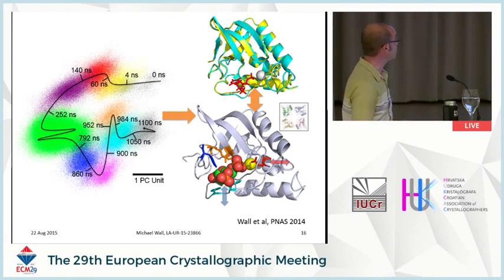And so what we found is we were able to get reproducible calculations of diffuse intensity using such a long trajectory. In this space, we were able to relate this to the functional motions of staphylococcal nuclease. In particular, in this projection, which is along the principal components of the trajectory, we see motions of this loop, which would likely modulate ligand binding. And we also see motions of this loop, which is related to the hydrolysis reaction.